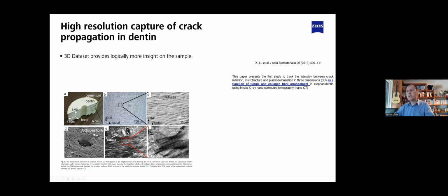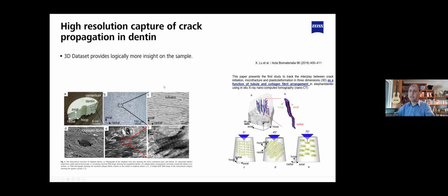However, you cannot really correlate them to the mechanical properties because, for example, in this light microscopy image or in that electron microscopy image, you see roughly the projections of the orientation of tubules in 2D. In high resolution TEM images, you might see the nature of the interface between tubule and matrix. However, the question is not answered, which is how the orientation of actual tubules correlates to the mechanical properties. As a next step, they used the Ultra with an Ultra loading stage.